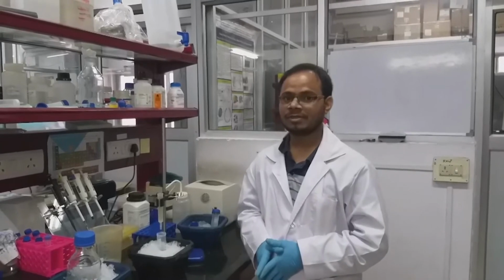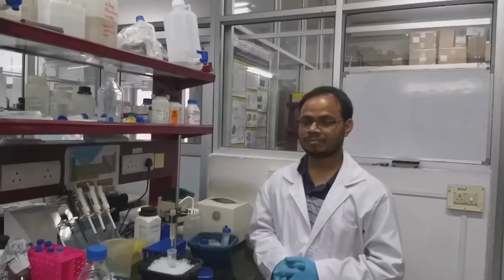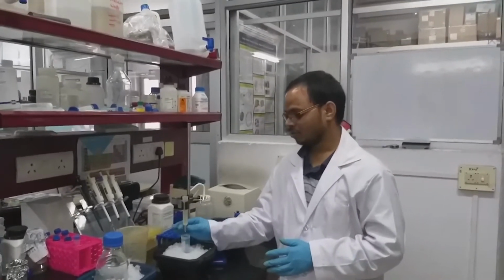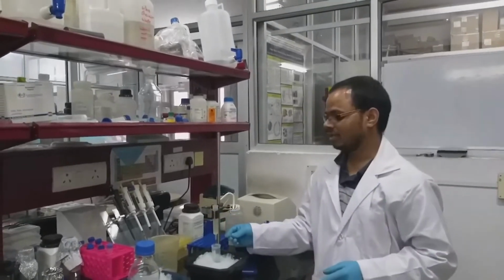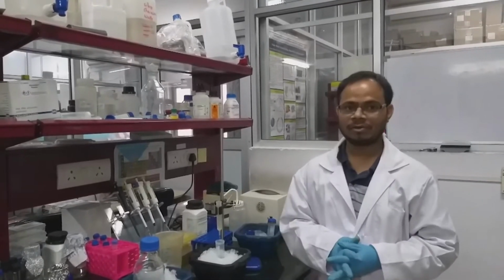After incubation with beads, we have to follow another 3 steps to get the purification completely done. First, after the beads are taken out from ice, you have to remove the outlet so that all the flow through other than beads will be taken out.